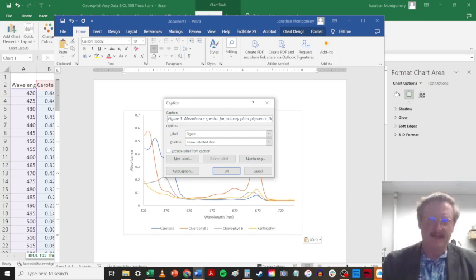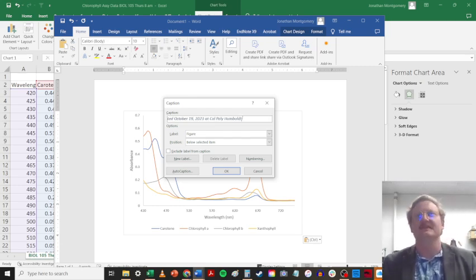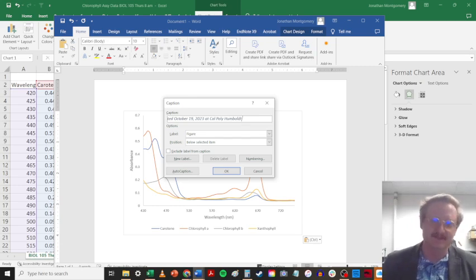Okay. Data collected. This will be what? Let's say October 19th of 2023 at Cal Poly Humboldt. Just to get in the habit of typing out decent figure captions.